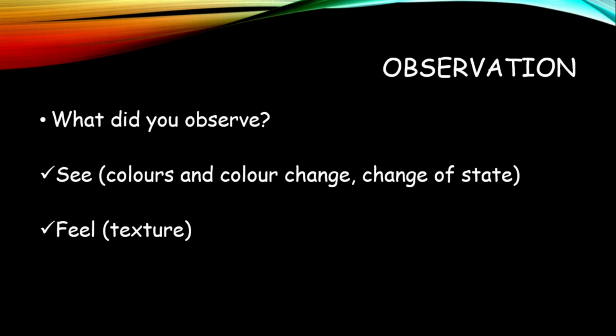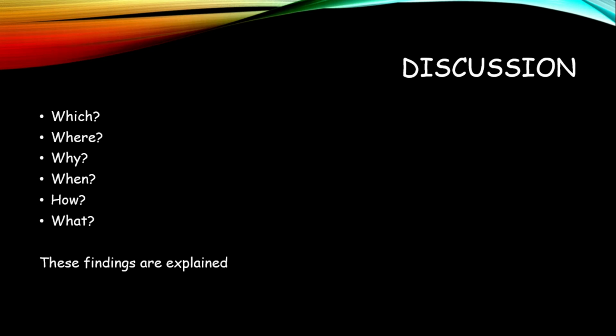What happened to the leaf? There are 2 leaves. What really happened? You really want to ensure that you're looking at the lab and you're capturing accurate information for your observation.